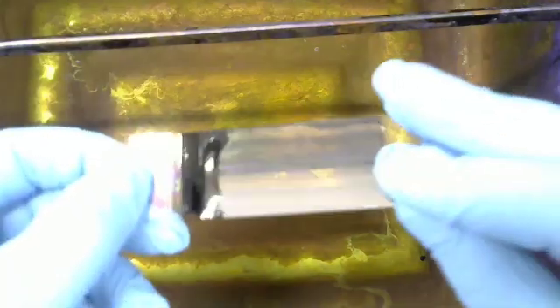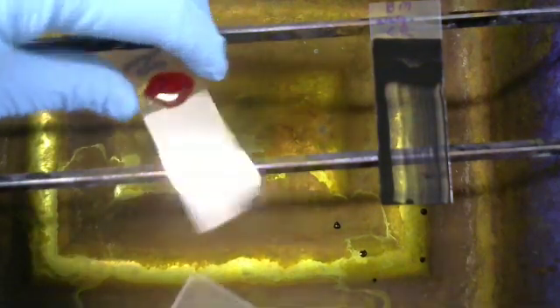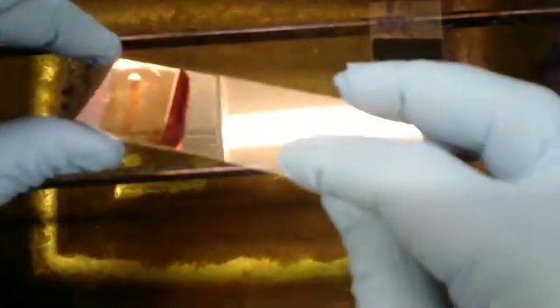Now, let's do it with a Congo Red. And now we let these dry using air dry.